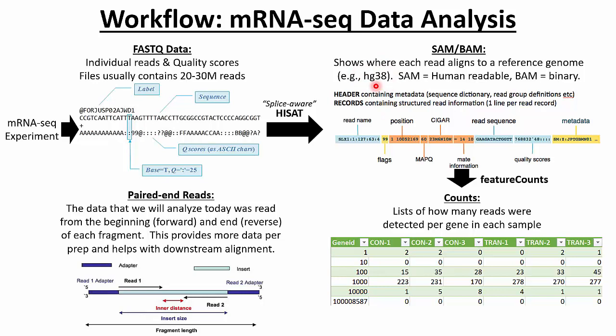In this case, we extracted them from human cells, so we're using the HG38 human or Homo sapiens reference genome. Okay, just a few more details on this file before we move on. First of all, there are several different options available to you in Galaxy and elsewhere for aligning fastq files and reads to reference genomes.